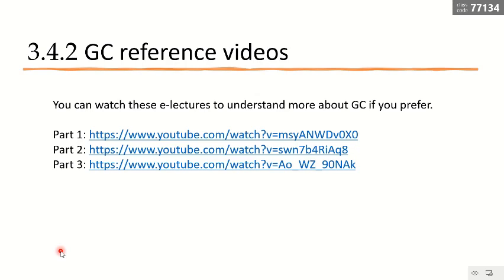There is a much more detailed explanation about the GC. You can skip the very technical parts we did not cover, such as the GC theory, basically the structure and how it works. I think that is the majority of the analytical part for ethanol as a reactant for biodiesel production.